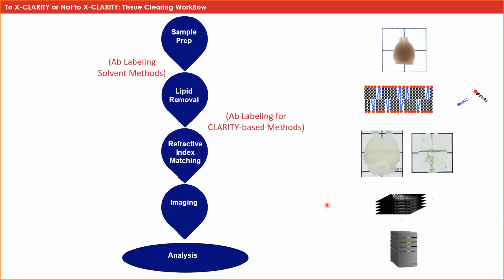So at this point, for those not familiar, we will introduce you to the Clarity method and X-Clarity system, and then come back to our recommendations for determining whether the X-Clarity system is something for you to consider.